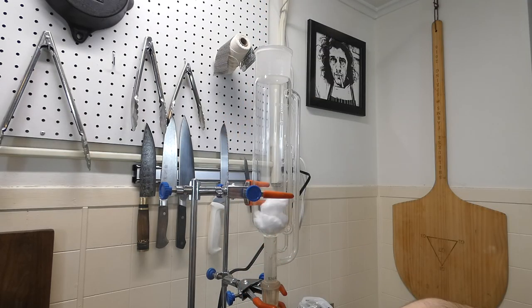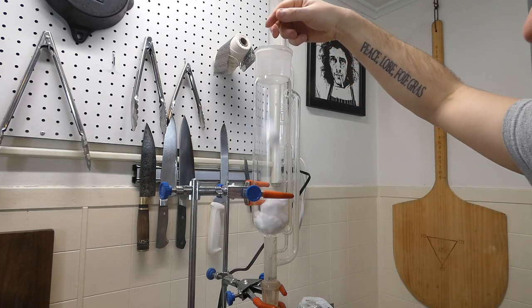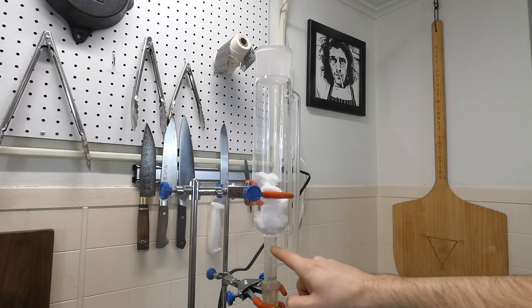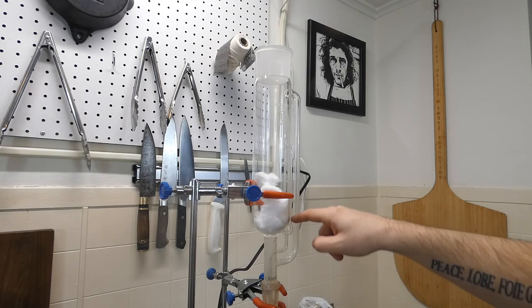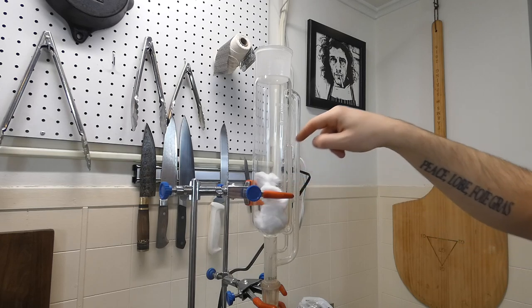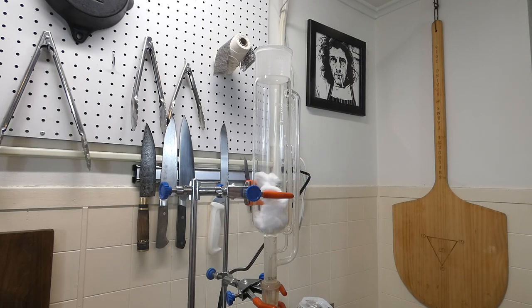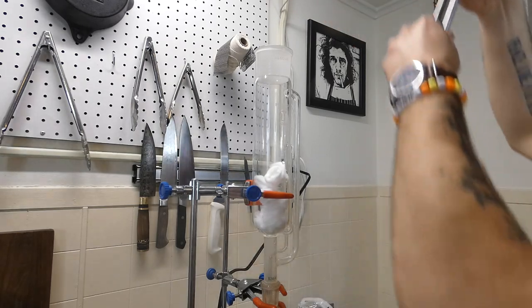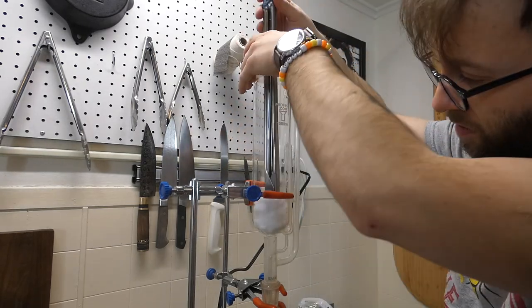The idea behind putting the cotton balls is so that pieces of the pepper can't get through this little arm down here. I'm not sure if you can see that on camera, but there's a little arm that goes up, and we don't want any particles getting in that and clogging. So, erring on the side of caution, I'm adding a few more cotton balls.